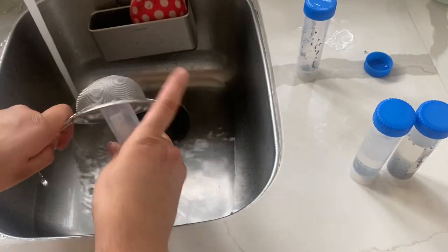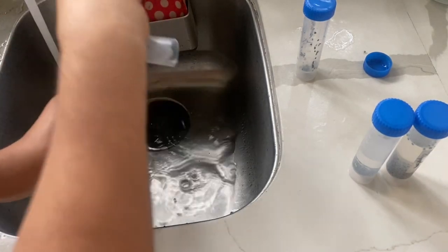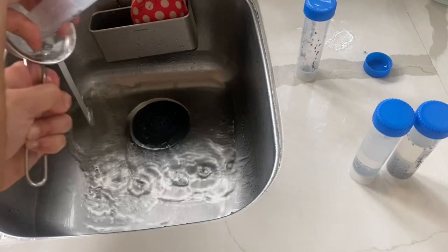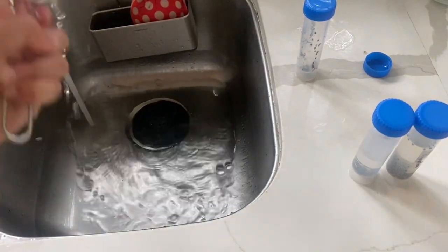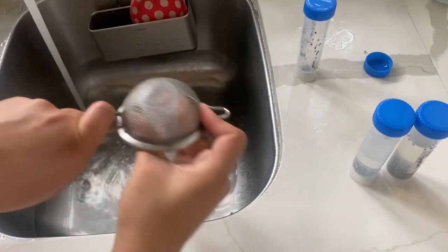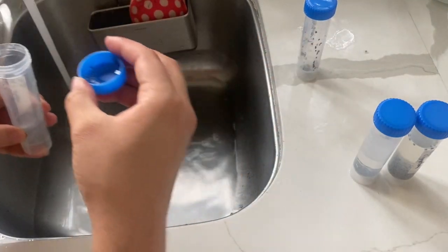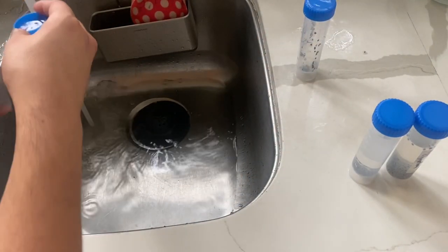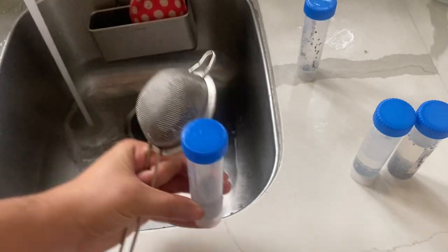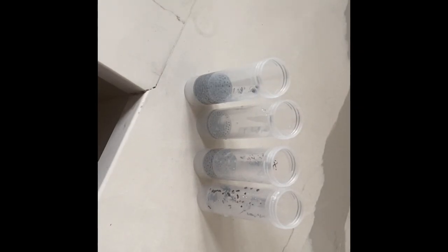Again, like the basil, you're gonna do the same thing. Might have to shake it a little bit since those seeds are so dense. But it's going to be the exact same thing. So after I finish washing all of these seeds and rinse them with alcohol, I'll get back and we'll put them on petri dishes. All right, so now I am going to go ahead and add this bleach.